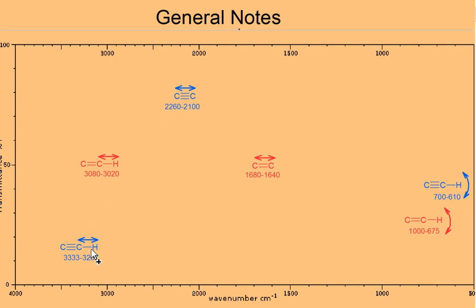We've got the carbon to hydrogen bond stretching when it's attached to the carbon to carbon triple bond. Of course, this is only for an alkyne bond which is on carbon 1 to carbon 2. If it's embedded in the chain somewhere, the stretch doesn't appear. And we also see that bending vibration again for the CH bond, somewhere between 700 and 600, usually moderate to strong. Keep in mind also, as we've said in the notes, if the alkyne is symmetrical, with the triple bond exactly in the middle of the molecule, giving us a mirror image plane, then quite often the triple bond doesn't appear.